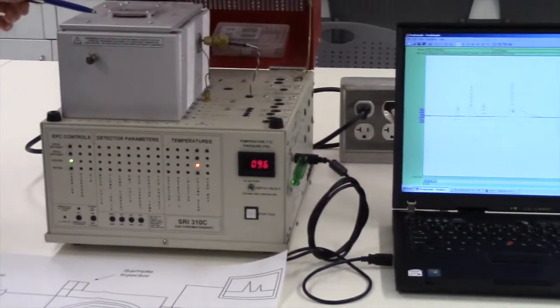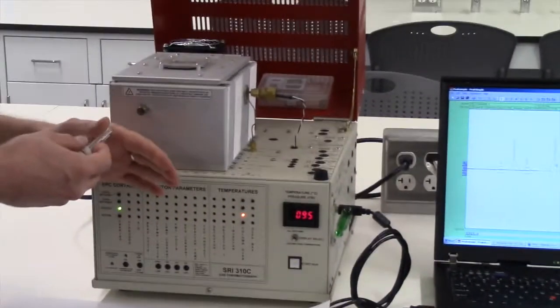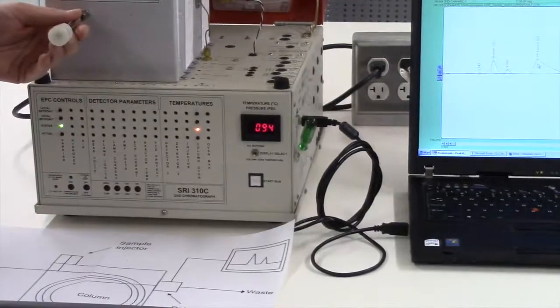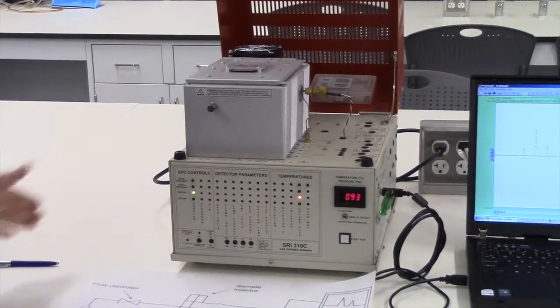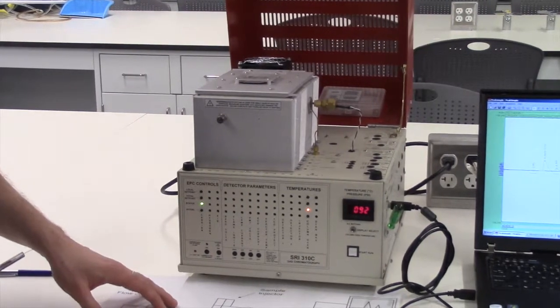So after injection, which I can demonstrate just for the video, inject it and start here. The separation process starts, and depending on the predefined settings, it will take from a few minutes to probably an hour.